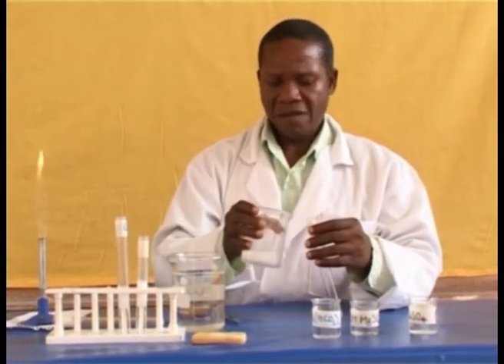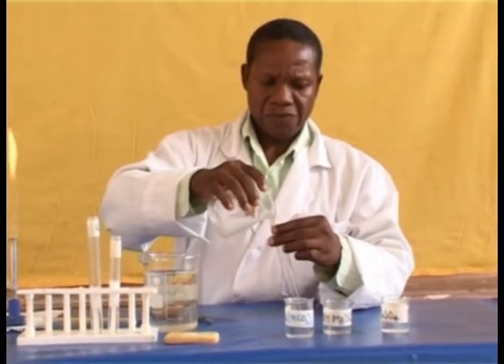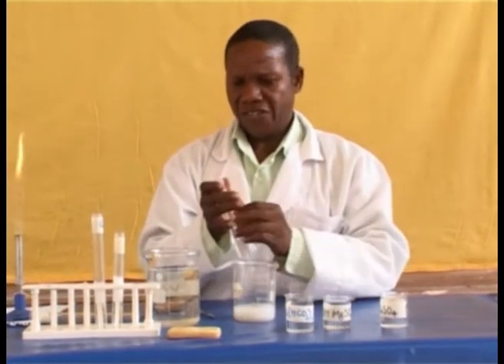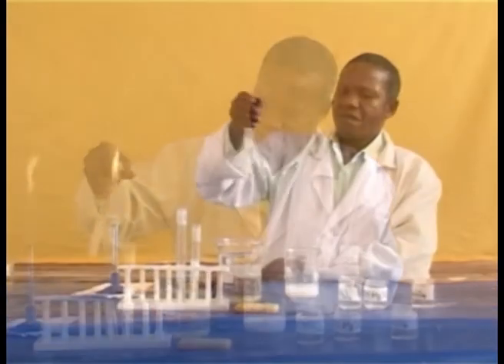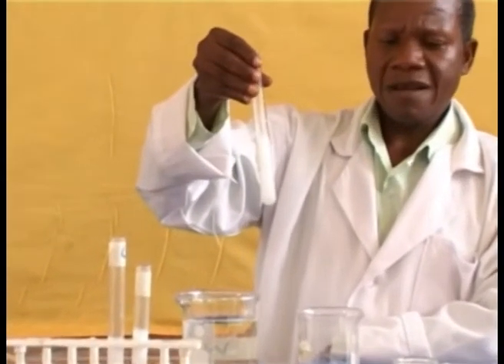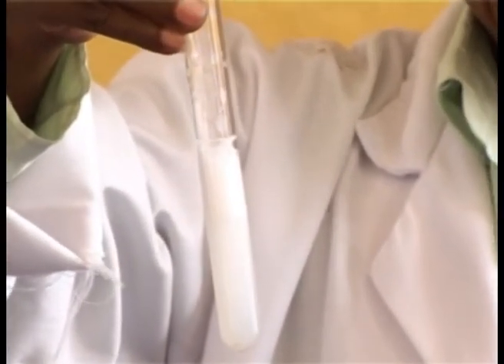Let us add soap solution. Shake. Now, the lather is formed after boiling the calcium hydrogen carbonate solution.